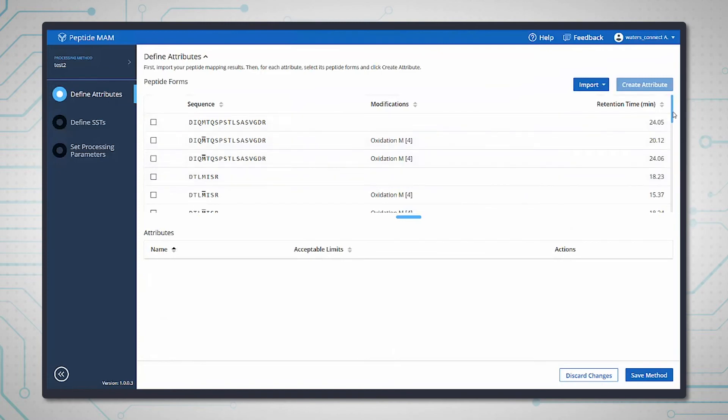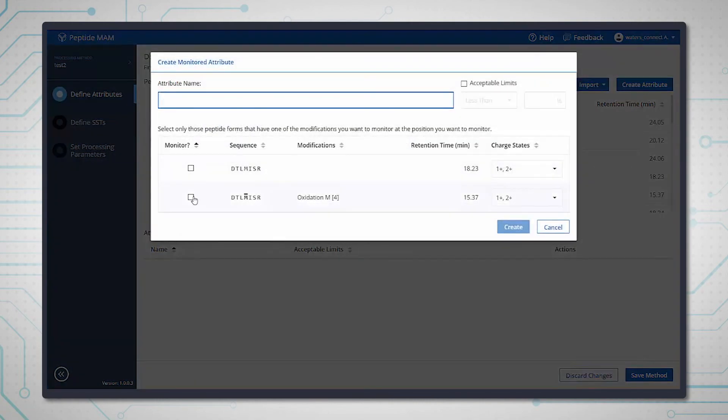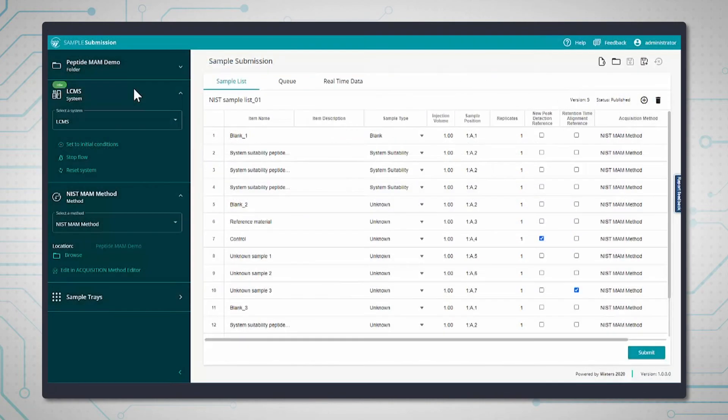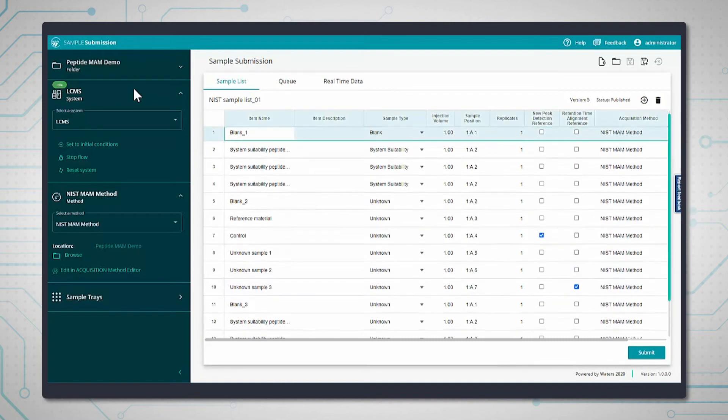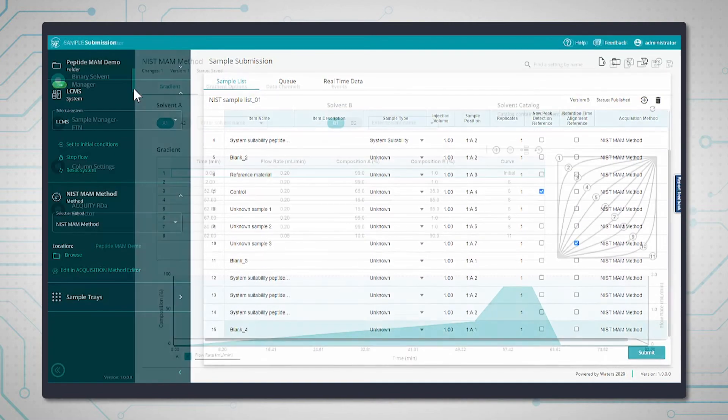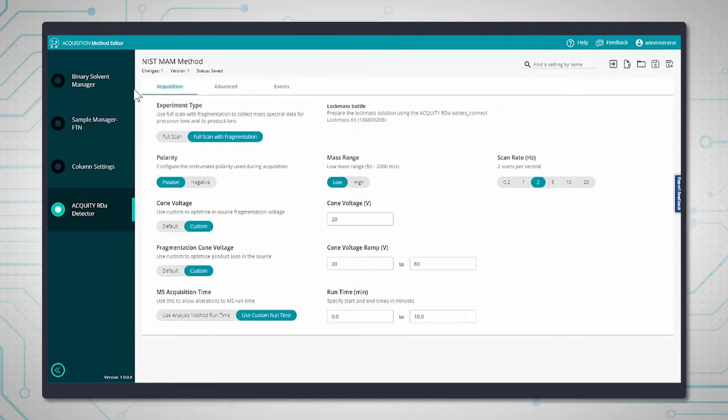The attributes can then be imported into a Peptide MAM method and the tolerances for each peptide specified. This app links up with other apps in Waters Connect including sample submission and the acquisition method editor to provide a complete workflow for Peptide MAM.